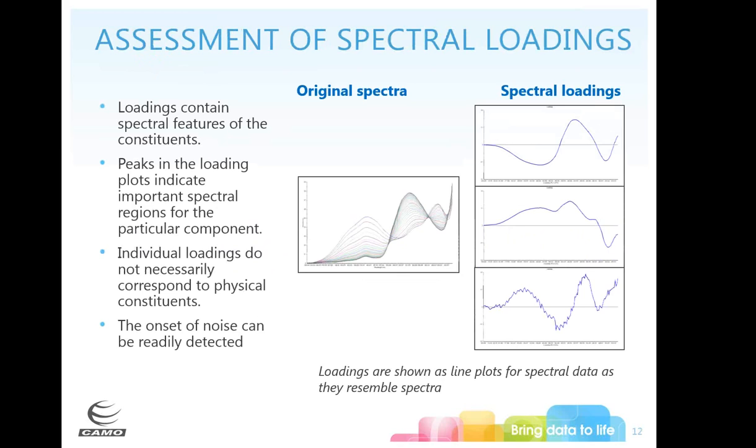Okay. The individual loadings, keep in mind, are not necessarily corresponding to physical constituents. It could be chemical changes, it could be some other things going on. But if you look at them in this way, you can very quickly tell when your noise is going to be seen.